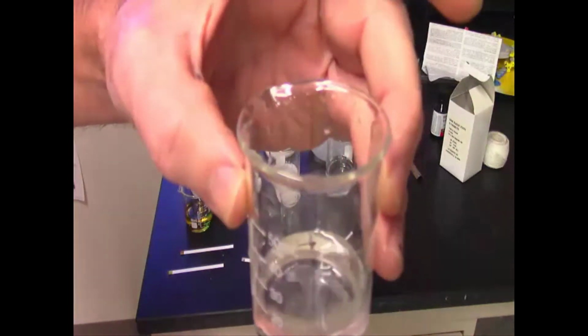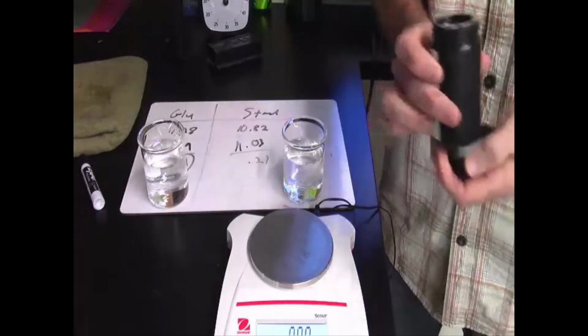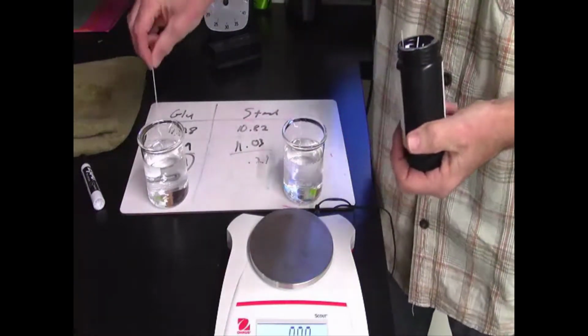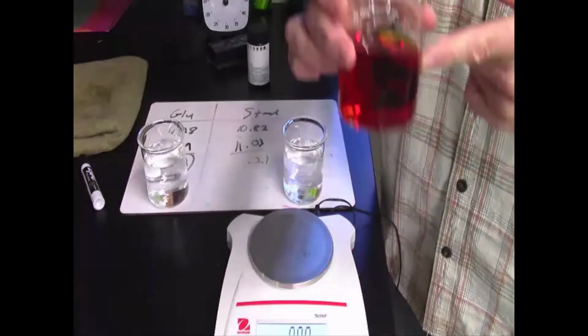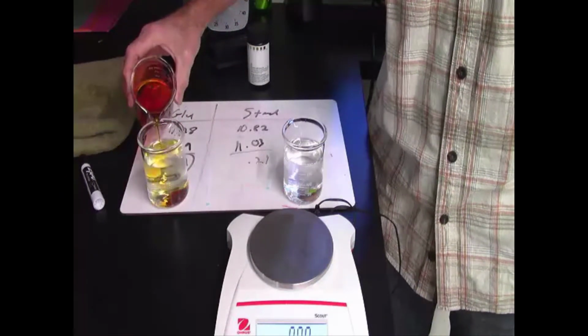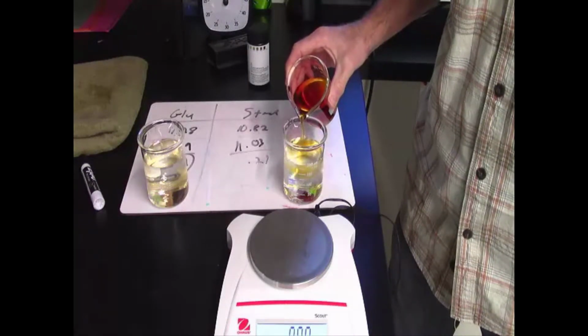And then this is water, and I hope there's no starch in there. And pour in the water, and yep. First, let's use the strip for glucose. Iodine solution. And we'll pour some iodine in here to see if there's starch in the glucose bag. Doesn't look like it. Let's pour some iodine in here, see if there's any.